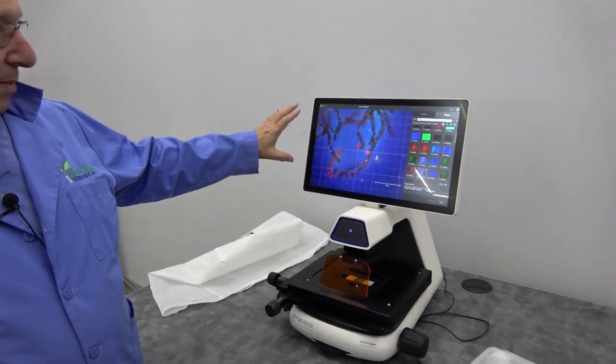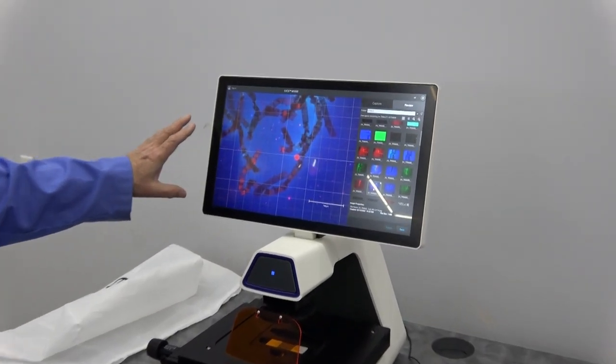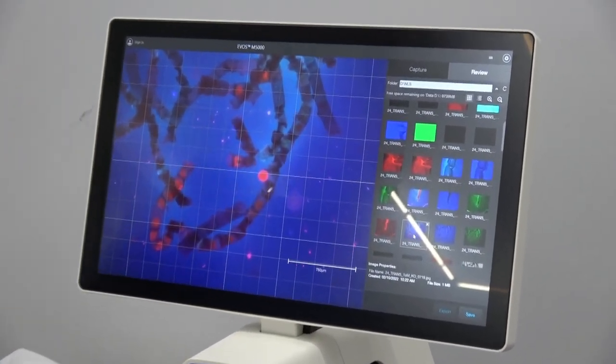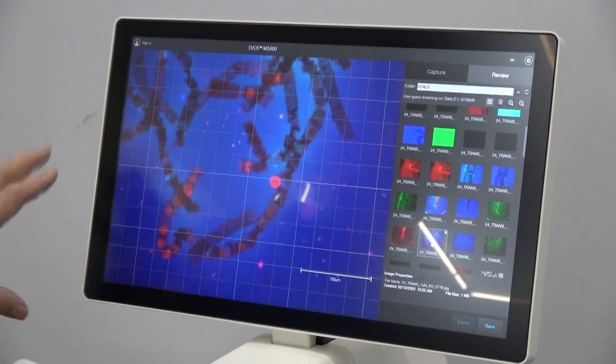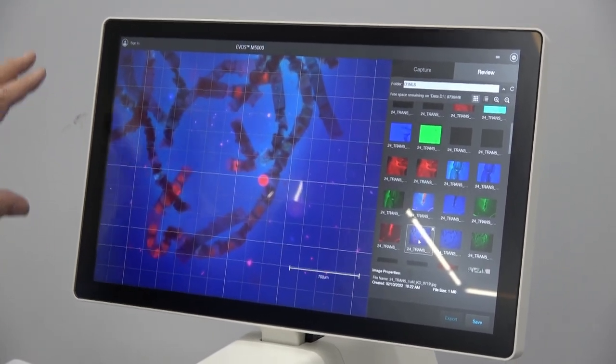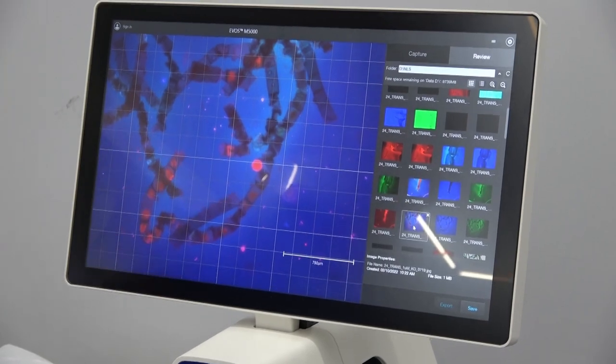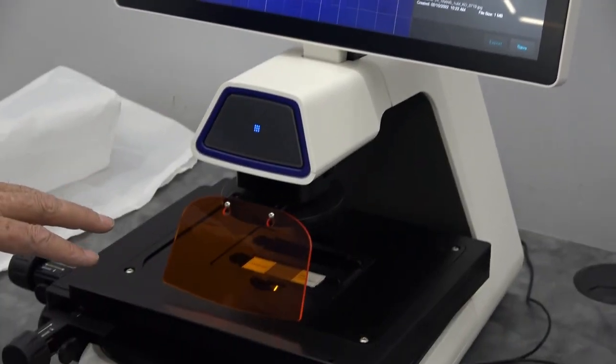This was an image that we took from a set of slides we had around. Very easy to produce this type of image with multiple filters and lights, up to five different objectives on the system at one time.